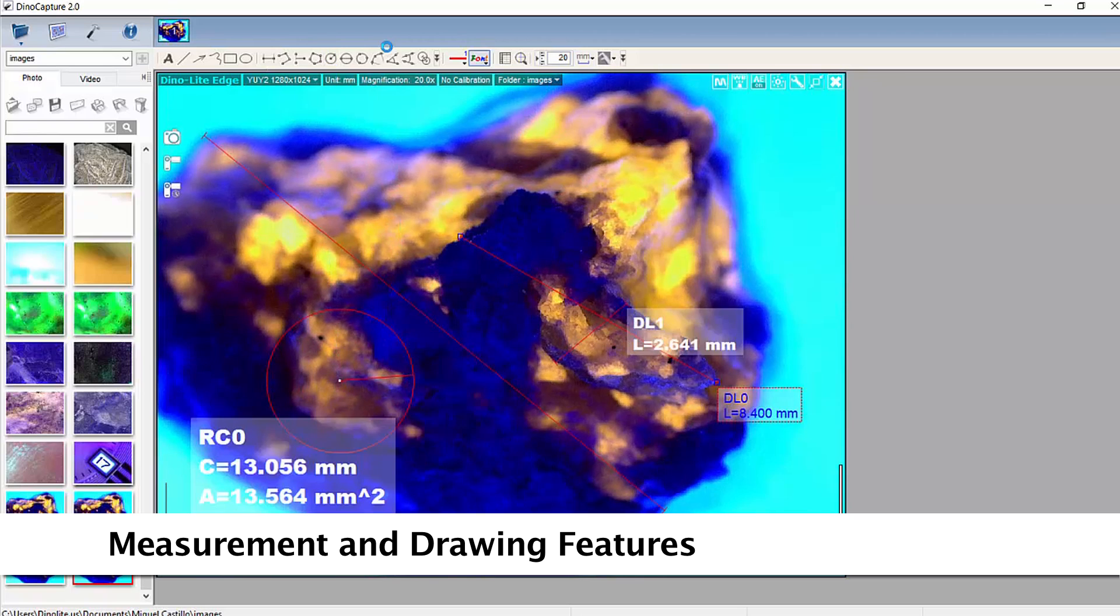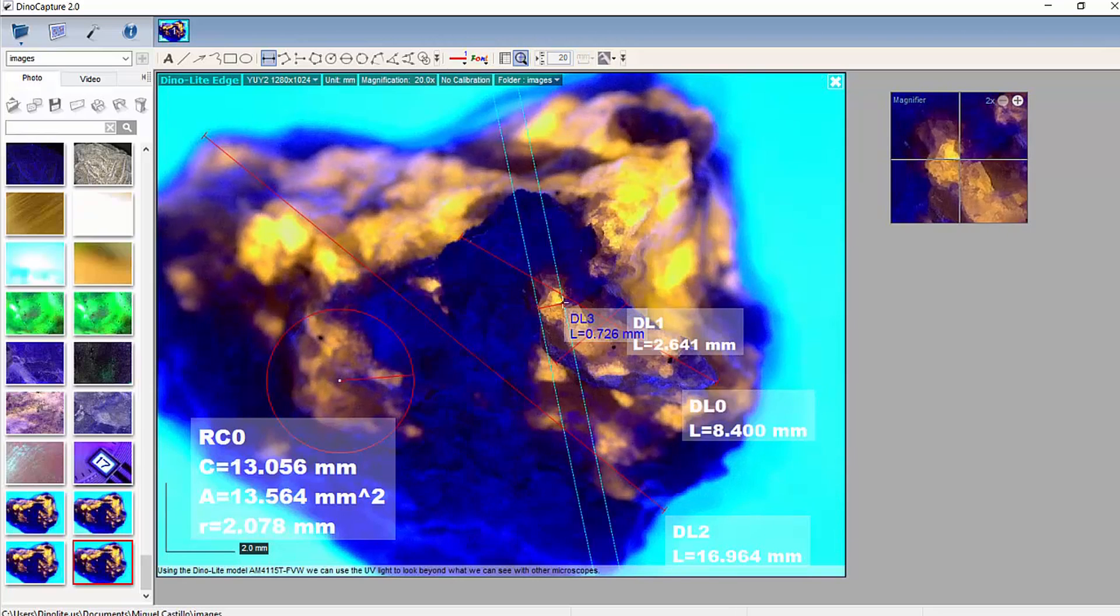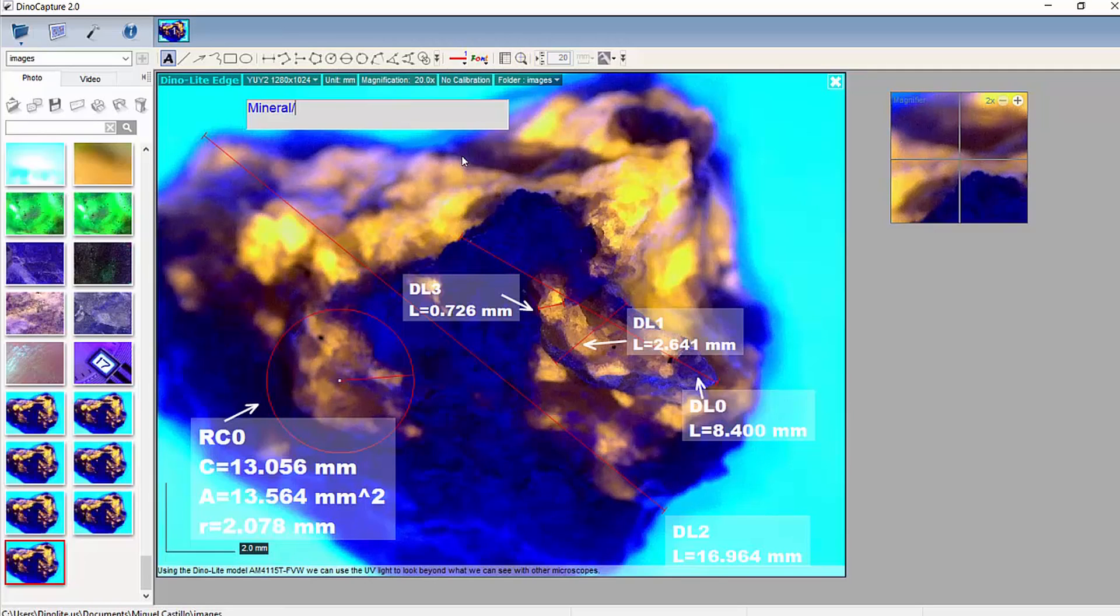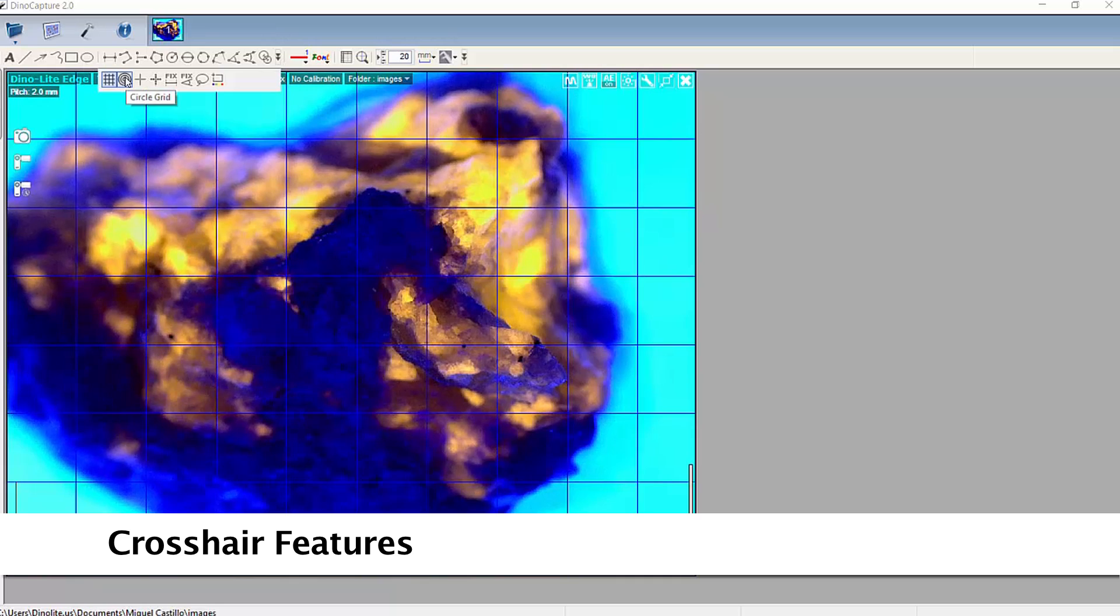The included Dynolite capture software includes drawing and text features, measurement, as well as searchable annotations. Measurement tools also include options for grid lines and crosshairs.